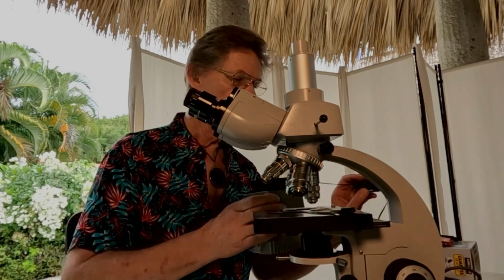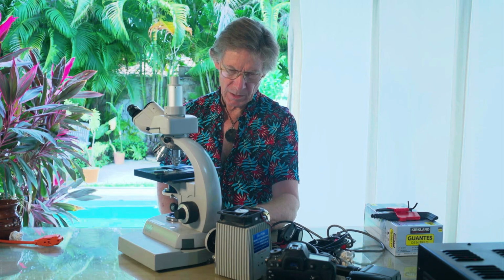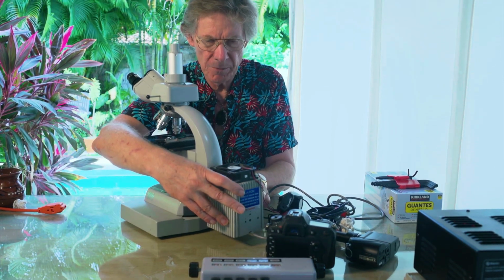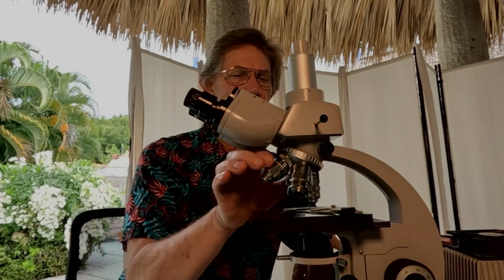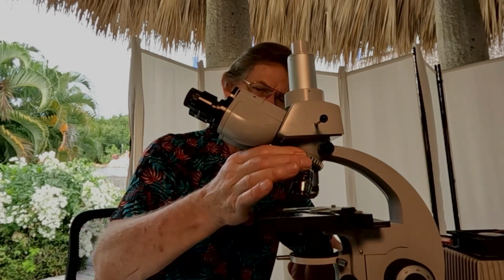Inside of it is a very powerful light bulb, and it hooks up to the back of the microscope, and I'm going to hook it up so you can see how that works. It hooks up like that and attaches very securely to the body of the microscope. The light is then transmitted from the bulb into the microscope. It's reflected by a mirror in the base of the microscope, and it comes up through the specimen and into one of the objectives or lenses. And that's how the microscope works.